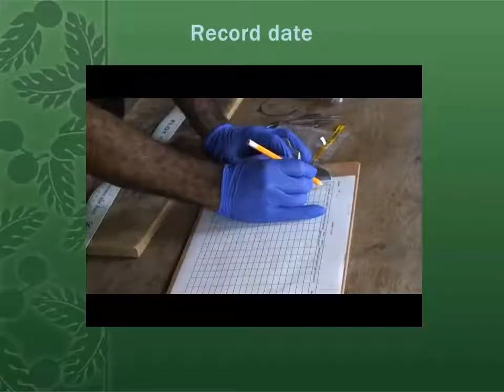It turns out that there are very few steps that are changed from the 9 modules that you've already viewed. I'll try to demonstrate that by using still frame captures from the previous 9 modules when we're simply repeating a step. The only new videos you'll see during this module are for the steps that are changed somewhat. We're going to begin with recording the date.